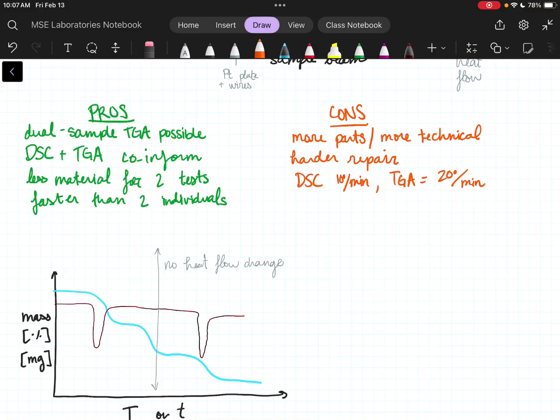If you know a certain area, oh, the melting point's right around here, could you do like, hey, slow down right at this point because it's going to be super thermally active? You absolutely could. DSC only collects well if you have a linear rate though. So any point where you're changing the rate, so let's say you were going 20 degrees per minute and then you slow down to 10 degrees per minute, in that minute or two while you're actually slowing the rate down, your DSC is going to be unusable.